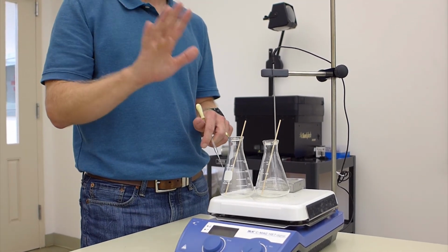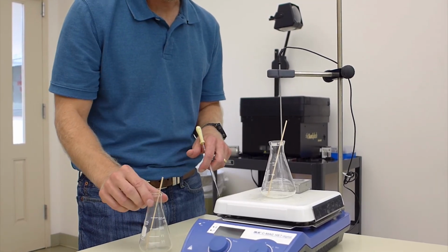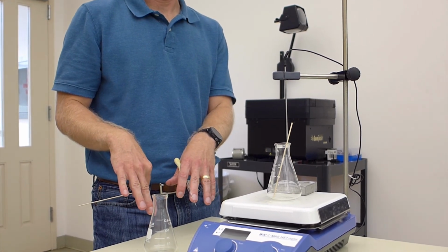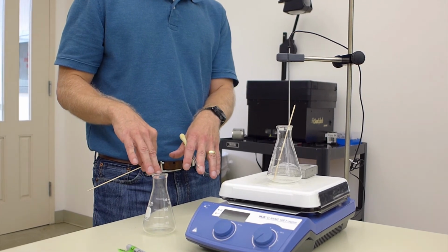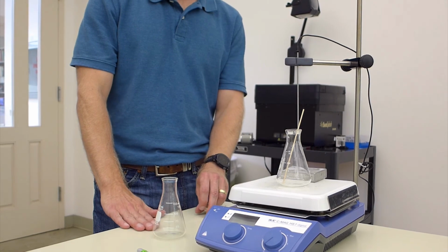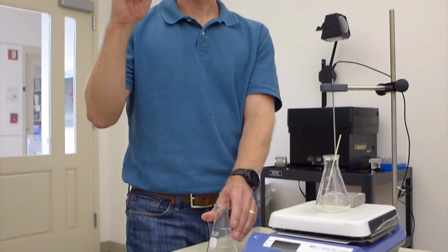Once you're there, you've hit the optimal point, and without hesitation, you should move this flask off, pull the boiling stick out, and allow the supersaturated solution to start to cool. Okay? Slow cooling is better than fast cooling. So some people actually like to put a towel on the bench because the bench tends to be cold. If you put a towel on the bench, it will insulate the flask a little bit, and the temperature will go down. It will go down more slowly.